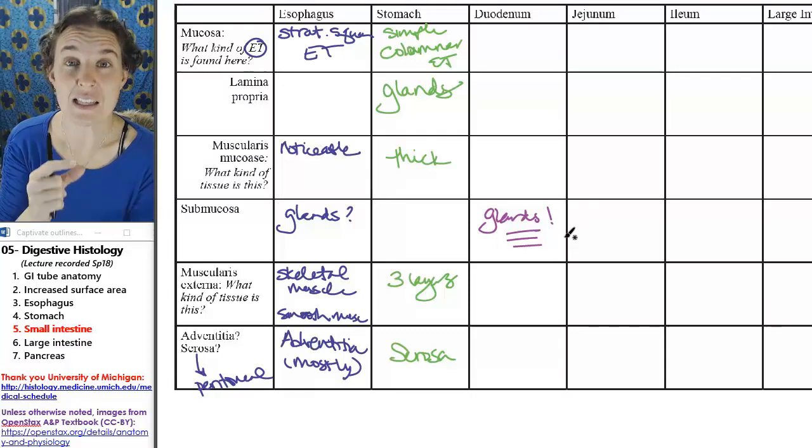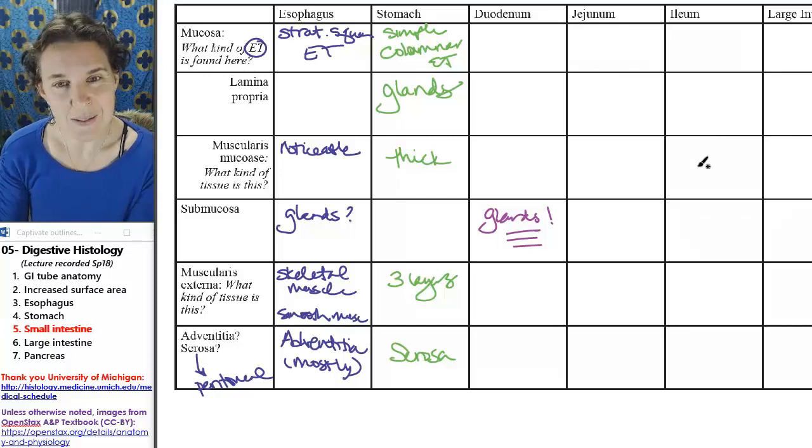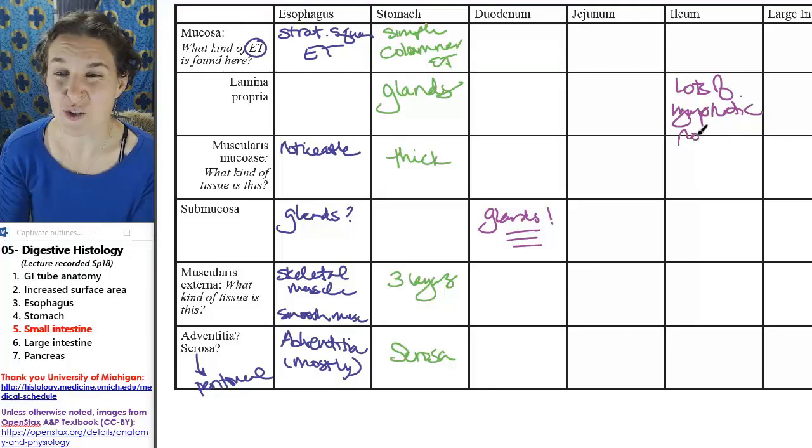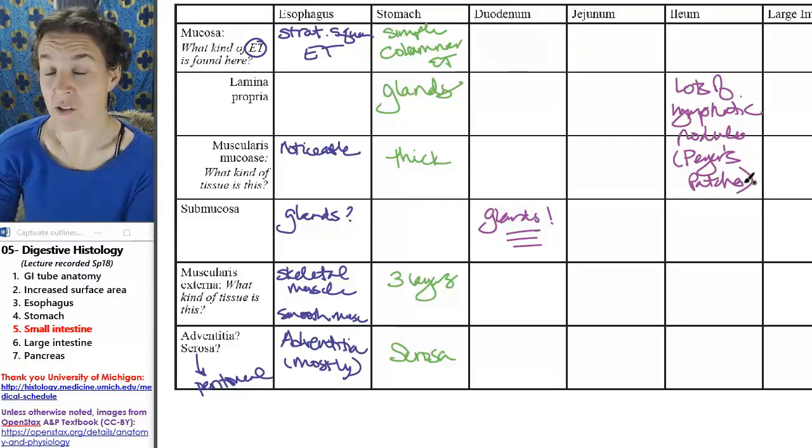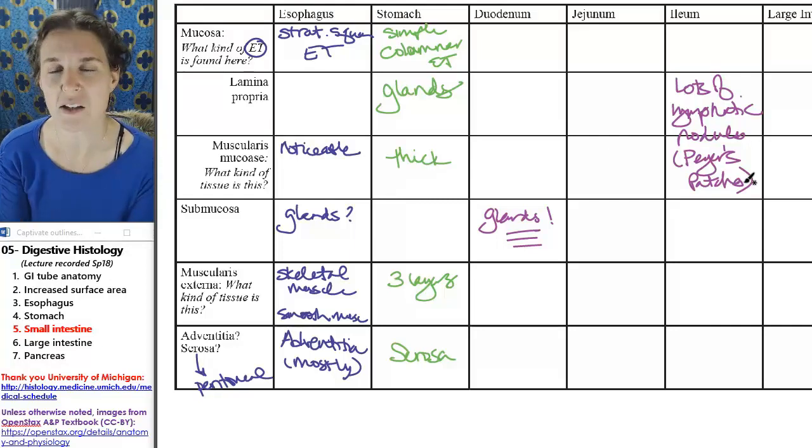The ileum has lots of lymphatic nodules in the submucosa or lamina propria, and they have a special name in the ileum. They're called Peyer's patches. I don't know why they're called something special there, but they're just lymphatic nodules. But if you see a whole bunch of them, chances are you're in the ileum.